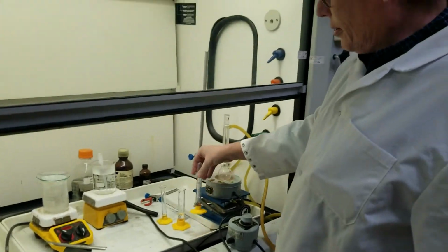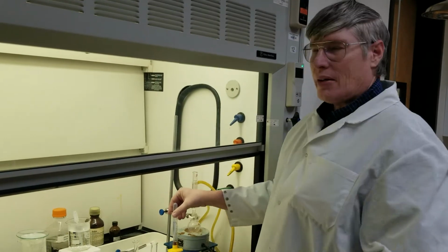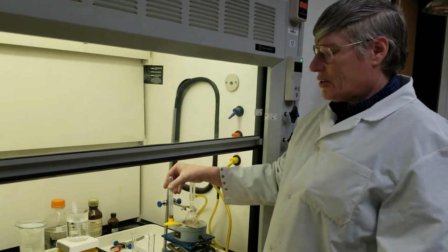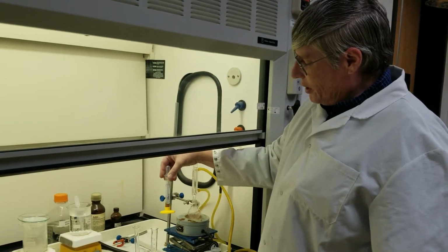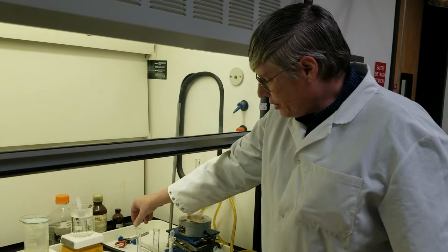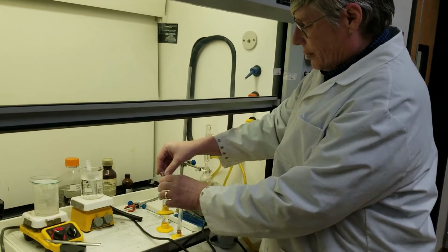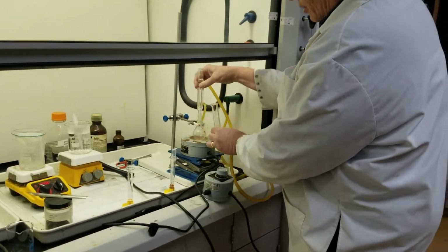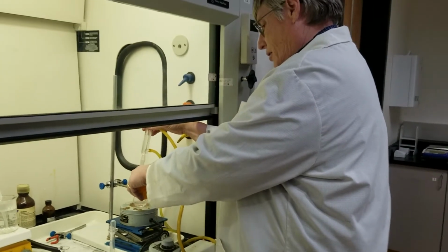In your stoichiometry, you need to do a stoichiometric ratio for the aniline of at least 2 to 1 because of the acid-base reaction that competes with this. And so hopefully we'll have enough aniline at a 2 to 1 ratio when we do it. So first step, we're going to weigh this compound and pour it into our reaction mixture. I'm going to first put the solvent in because we don't have to weigh it.